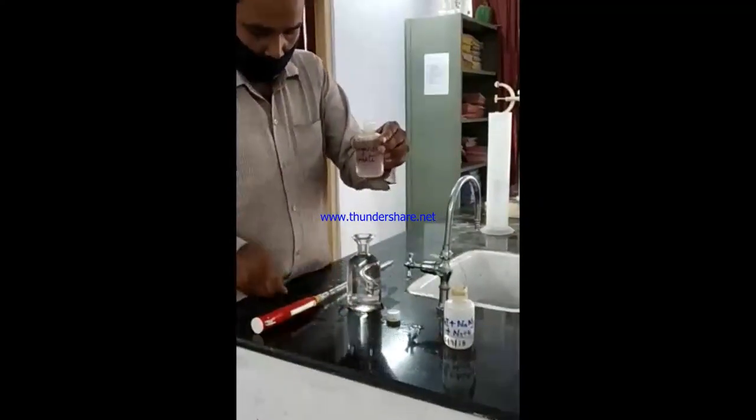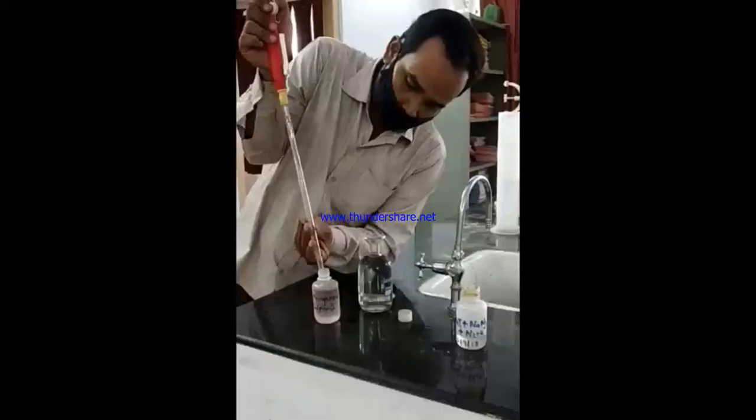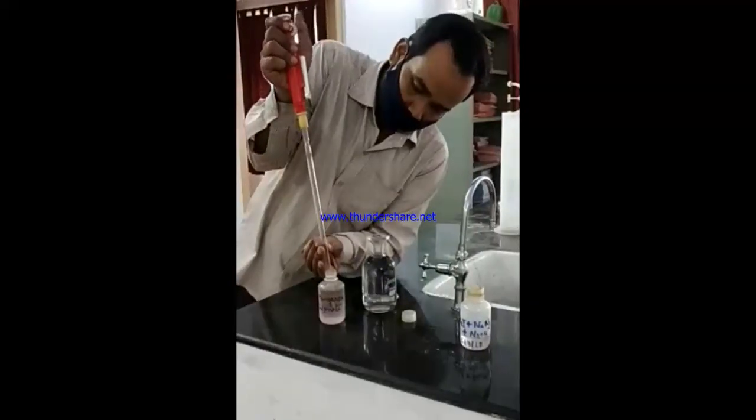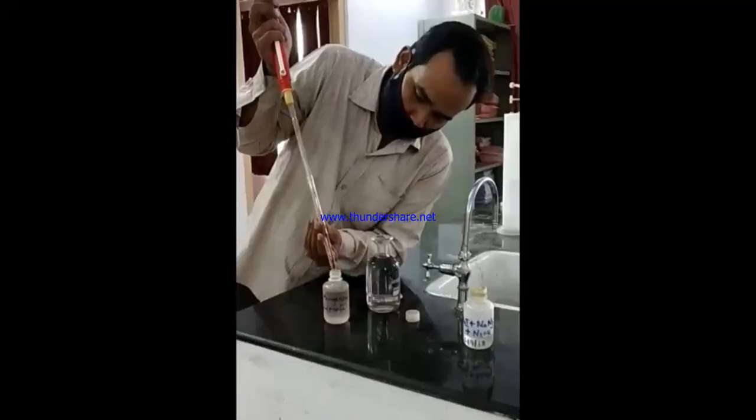Now in the BOD bottle we will add 1 milliliter MnSO4, manganese sulfate. Very carefully we have to take out 1 milliliter of manganese sulfate solution, not more than that.